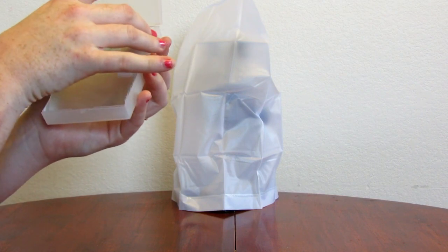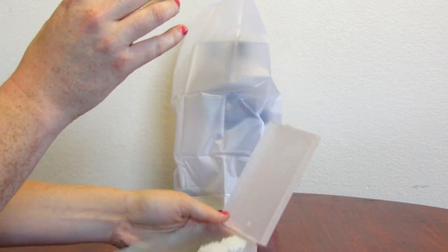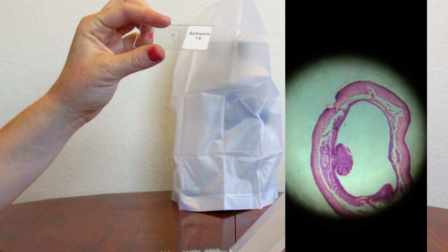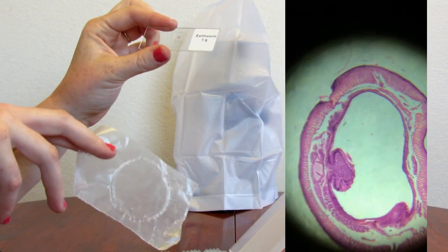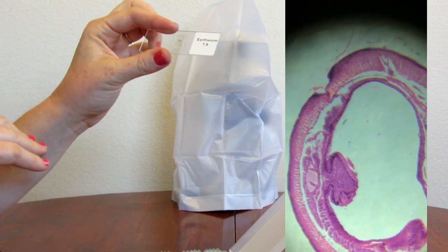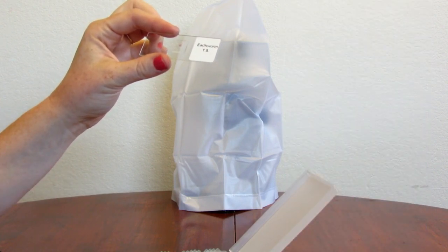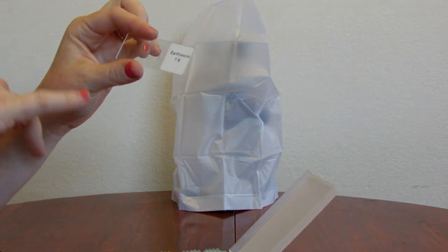The earthworm section is one that I recommend using a wax paper underneath that lens just to kind of diffuse the light a bit more, and you can see more detail.